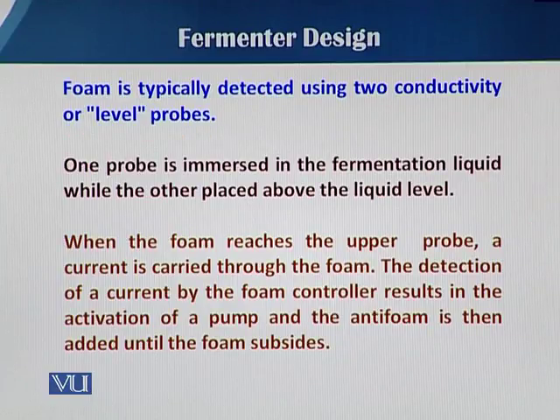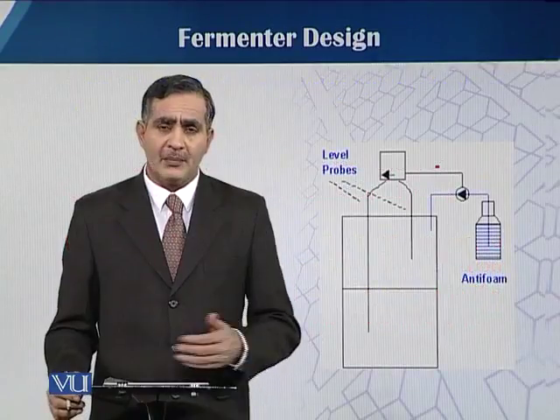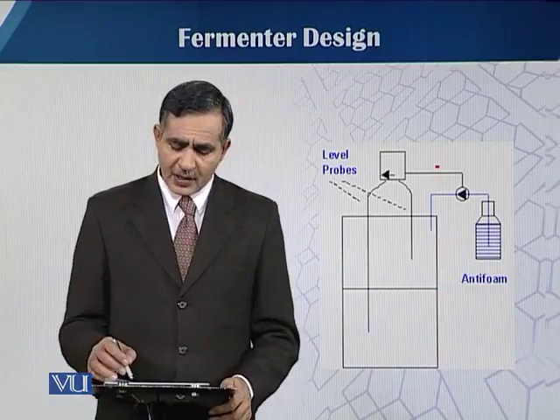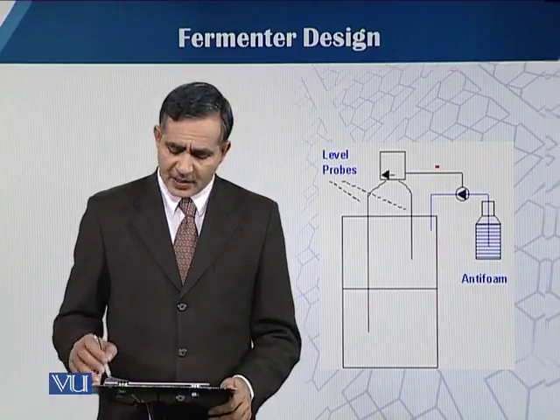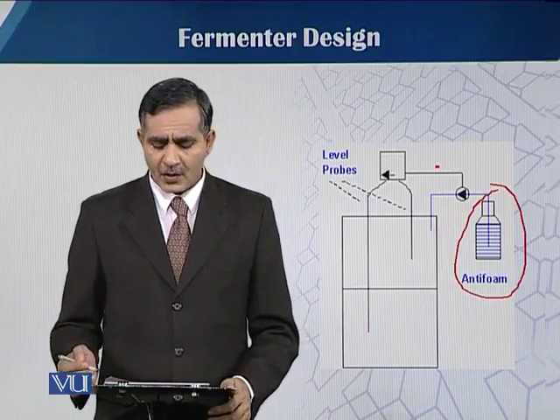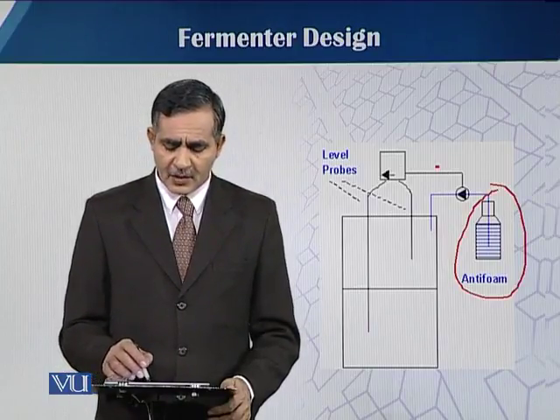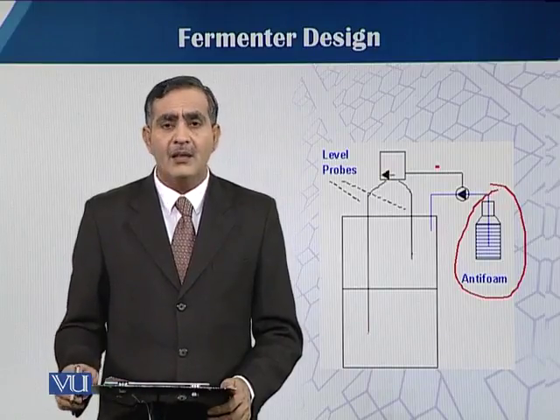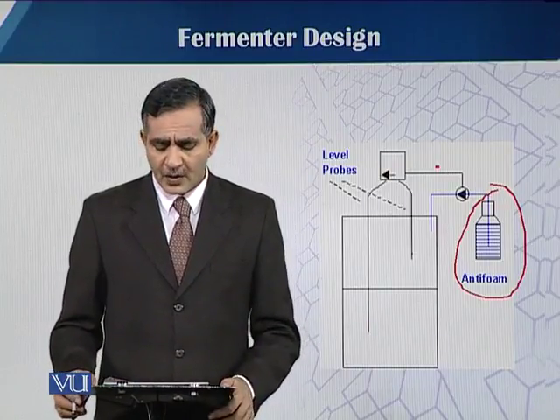In this slide, you can see the same representation. Here you can see one bottle attached, containing the anti-foam material. This is the medium. This is the level probe and this one is the low level probe.